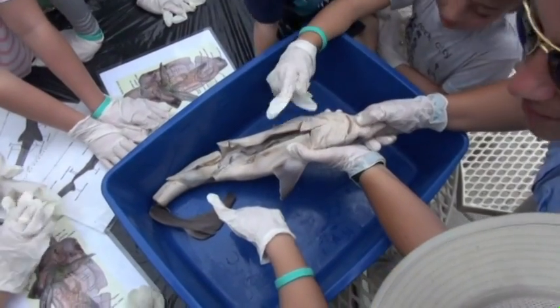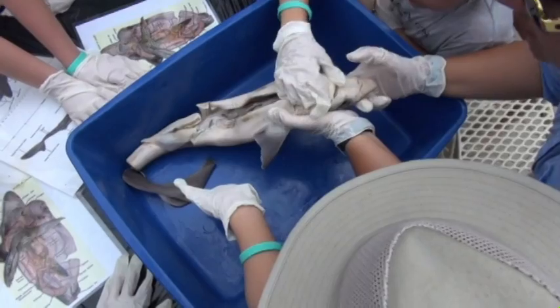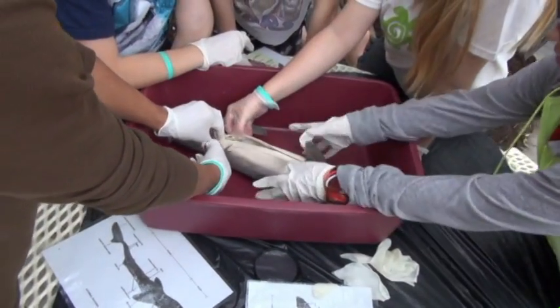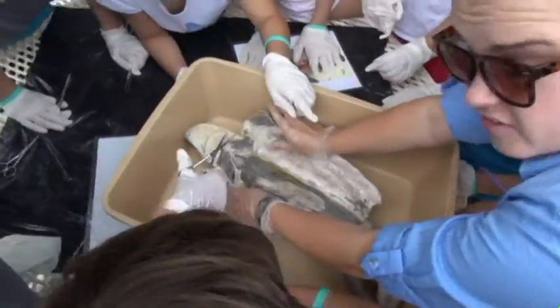But it's already dead. It is already dead, but if we squeeze it, we can root out the internal organs that we want to show you guys, okay? Here? Yeah. I guess just cut. Are we gonna pull out the part with our tweezers? We're gonna pull out everything.